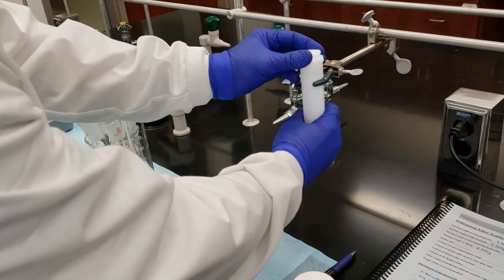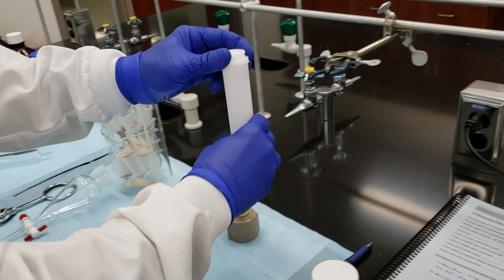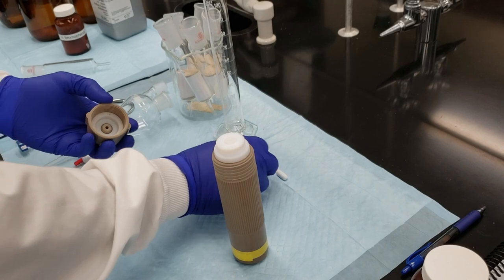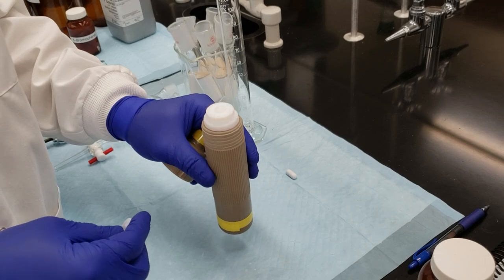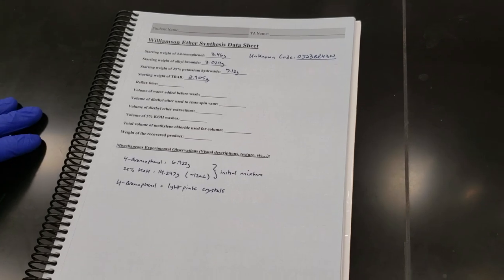This will seal our Teflon vessel. Put it into our outer sleeve. We're going to wait to cap it off until we get it over to the microwave. So let's go get this set up to reflux. Before we move over to the microwave, let's take a look at our data sheet.